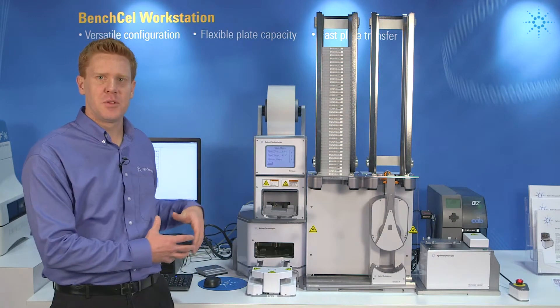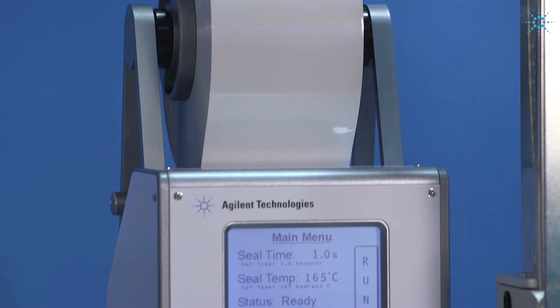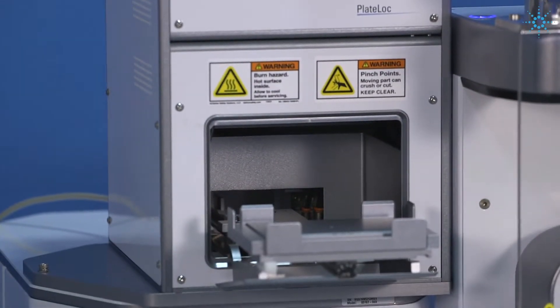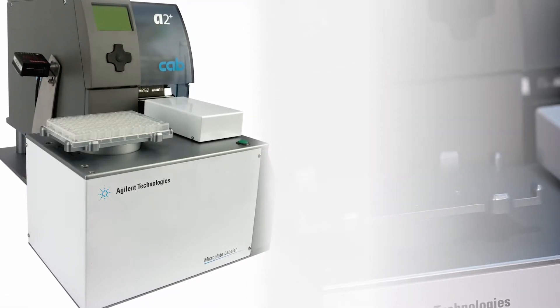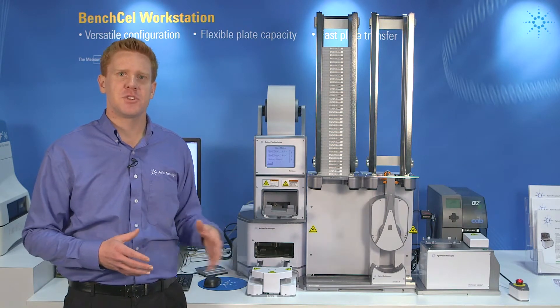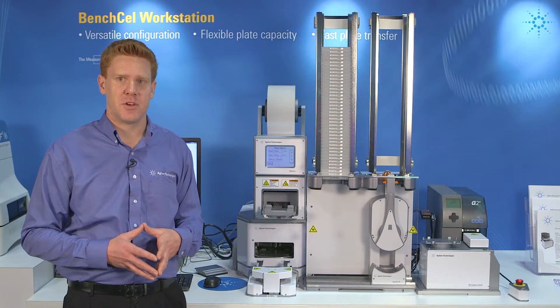From the BenchCel Workstation, we have the ability to integrate in multiple devices. For example, if you integrate in the Agilent PlateLoc Thermal Microplate Sealer, you can now have an automated plate sealing solution. When you integrate in the Agilent Microplate Barcode Labeler, you now have an automated barcode labeling system. Additionally, when you integrate multiple devices together, you get a much more complete workflow that enables you to get more hands-off time for your experiments.